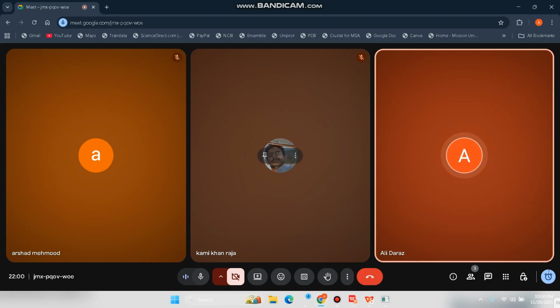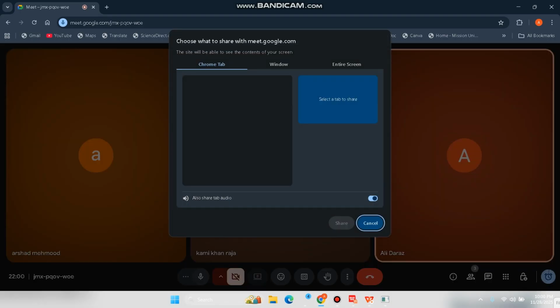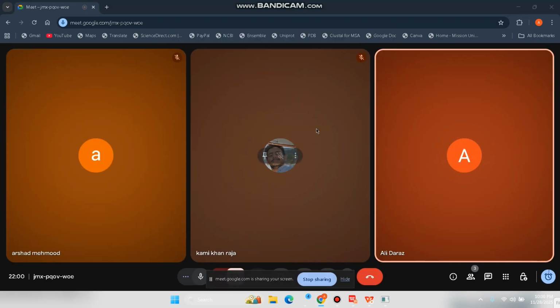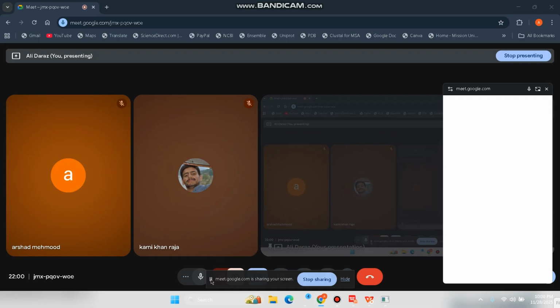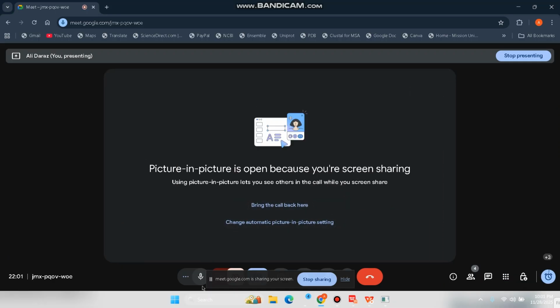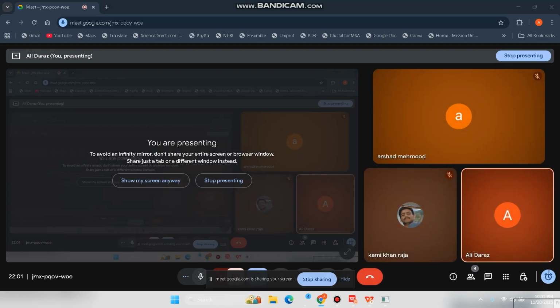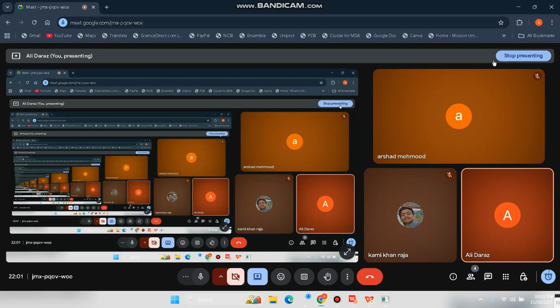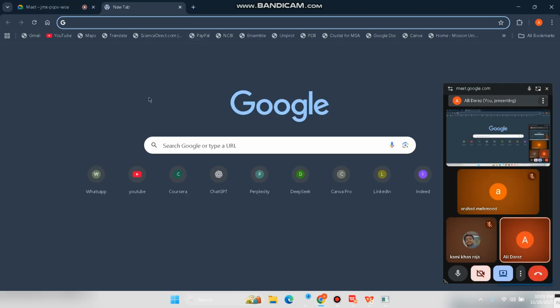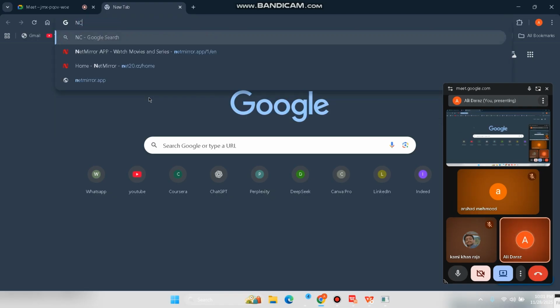Okay, now I'm going to share the screen for you. First of all, type NCBI.